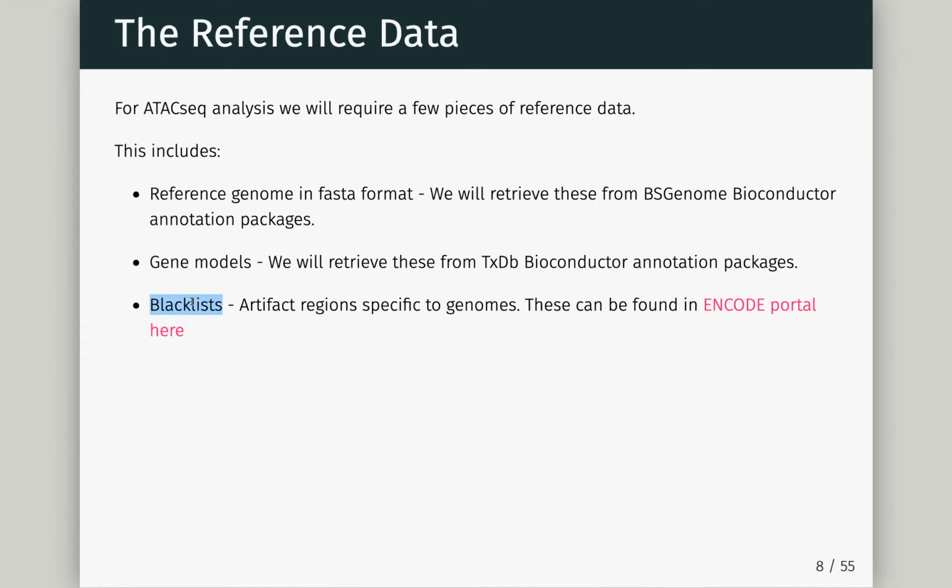If a region which you think is 100 base pairs long is actually 100,000 base pairs long, when you go to get a random sampling of reads over that region, randomly sampling over 100, you're not going to get many reads. Over 100,000, by chance, you get a lot of reads. And then when we realigned it back to the genome we understand, we end up with this tiny region, 100 base pairs, which is probably repeated 1,000 times in the genome. We map to that one region and we just get a pile up of reads.